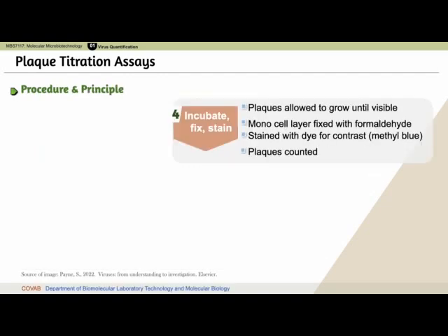Now let's go to step number 4. We allow the plaques to grow until they're visible.